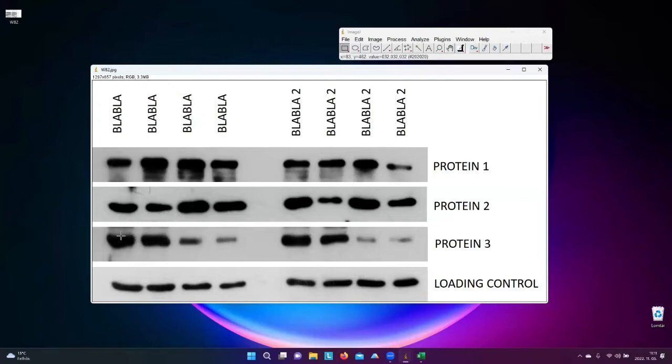So if you go with the single selection, which means these rectangular ones, with the left click, you can select the band that you want to see. If you are going to do the selection, it is important to take care of the size of this selection because the band should fit inside perfectly. And after you have selected it, there is a button combination, Control 1, and then a number will appear inside this selection. So that shows you that you have selected one of the bands.